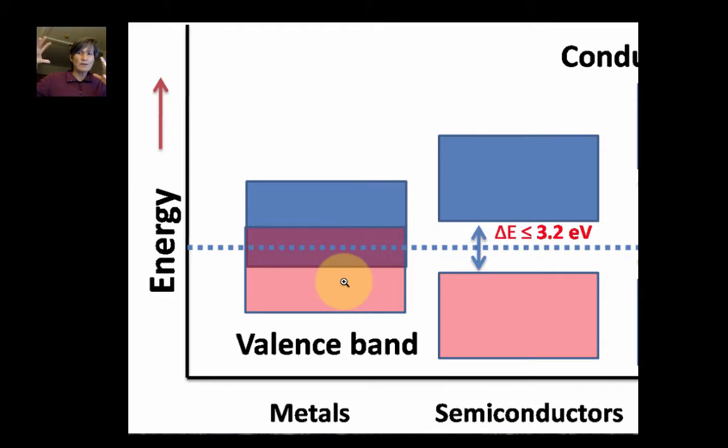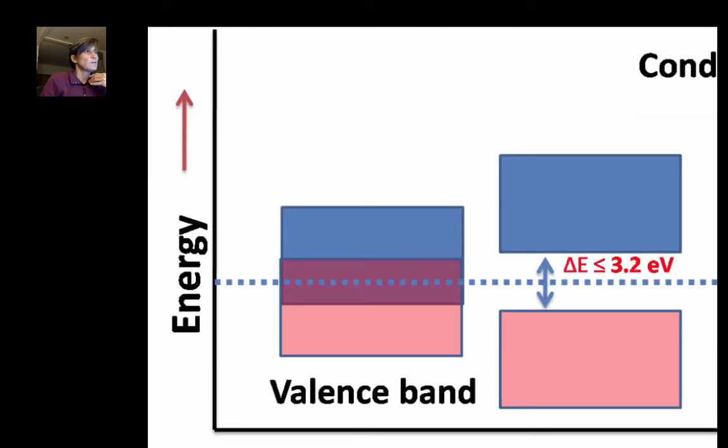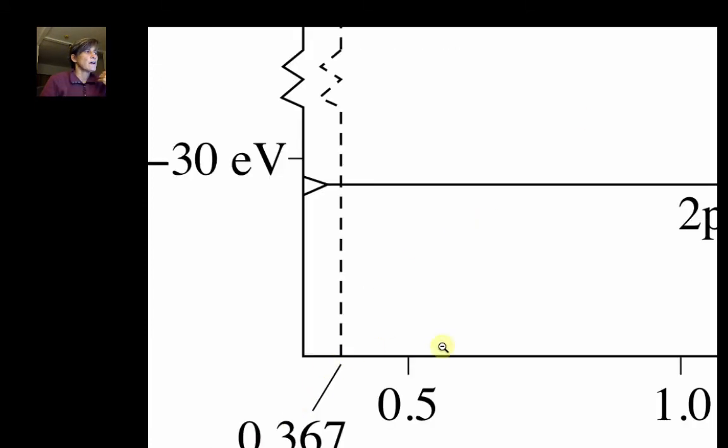So the valence electrons on the outside are intersecting with the adjacent atoms and feel the presence of those other atoms. Whereas at the lower levels, we would see these discrete energy levels down here, as they would be in the absence of any other atom, if they were an isolated atom. I hope I'm making sense.